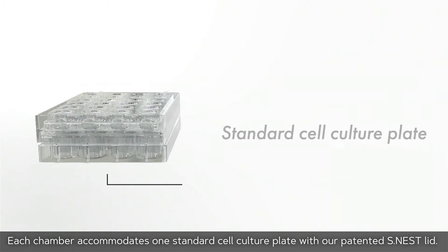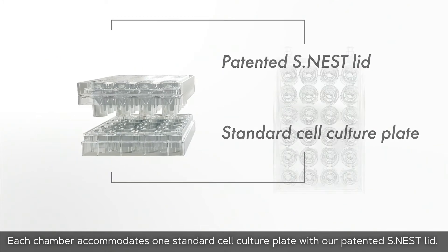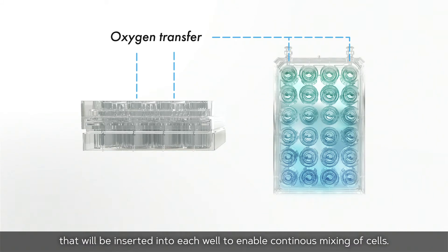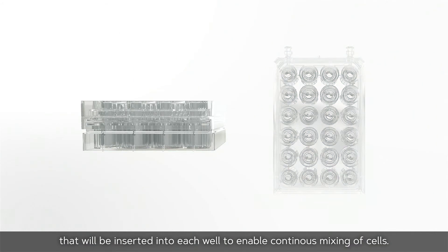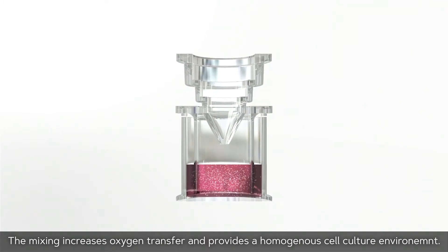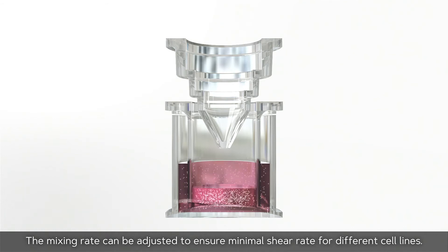Each chamber accommodates one standard cell culture plate with our patented S-NEST lid. The S-NEST lid consists of 24 tubes that are inserted into each well to enable continuous mixing of cells. The mixing increases oxygen transfer and provides a homogeneous cell culture environment, and the mixing rate can be adjusted to ensure minimal shear rate for different cell lines.